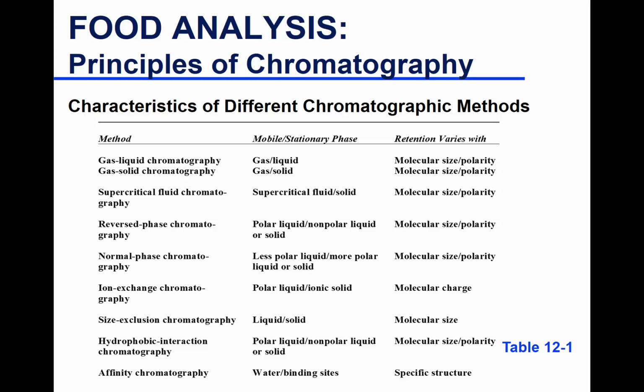The more it interacts with the column, the longer the retention time. Okay? So back to the shopping example. I have 0 retention time in the store. My daughter has probably 5 hours retention time in the store. Well, no longer. Now she goes, ooh, she's 15.